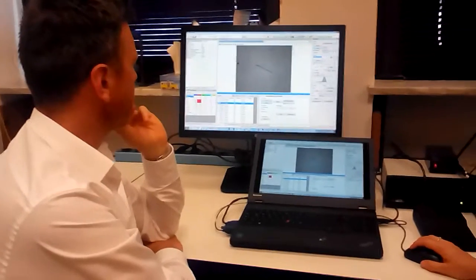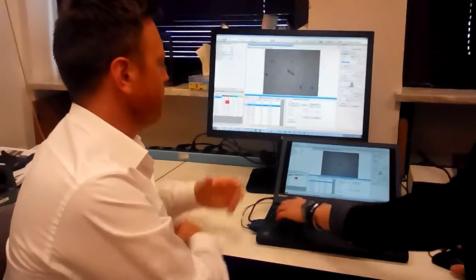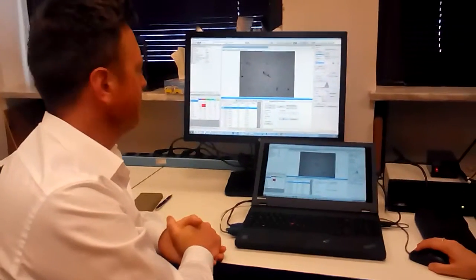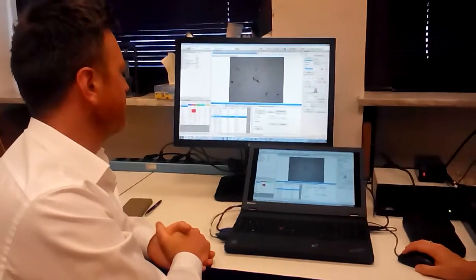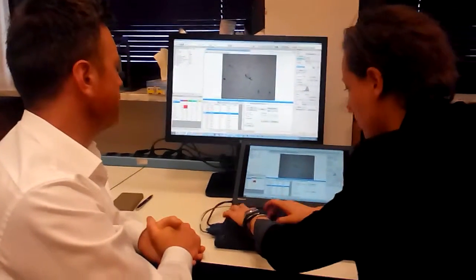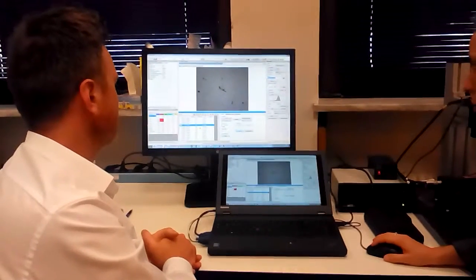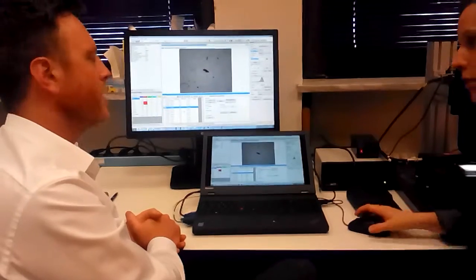Yeah, so you might do this, for example, if you just wanted to take the top 5 biggest particles. Yeah, I want to highlight them because they can cause, or most probably they will cause, the major damage on your component. Right, I see. So for many customers, it's quite interesting that they are reported in a separate slide.